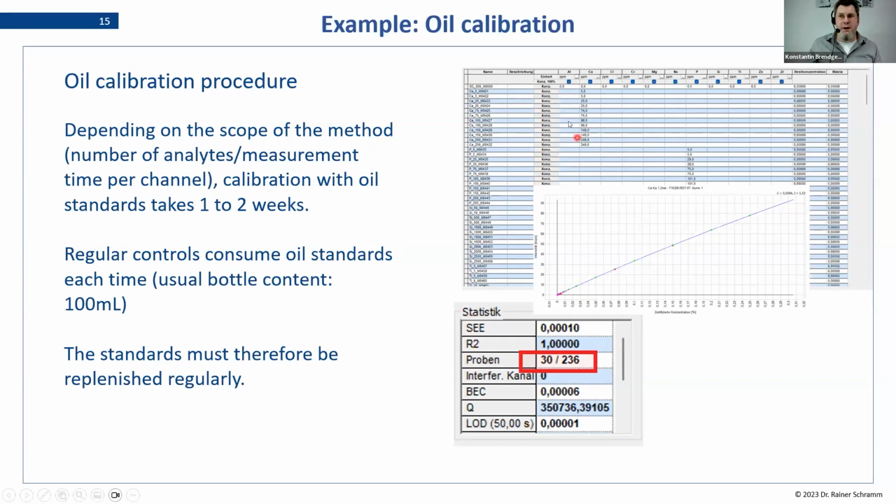In fact, when I was doing this, it took me 2 weeks in total to get the standards prepared, measured, and do the calibration. And by the end of these 2 weeks, I had almost used up most of the standards that were available. Keep in mind, these are like 100 milliliter bottles that you buy.